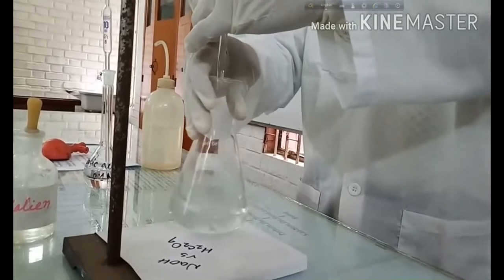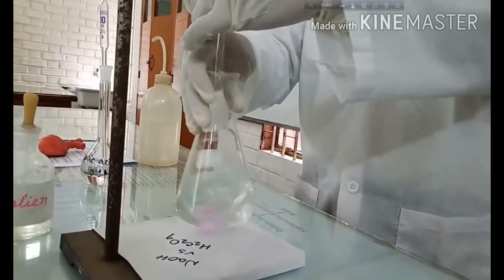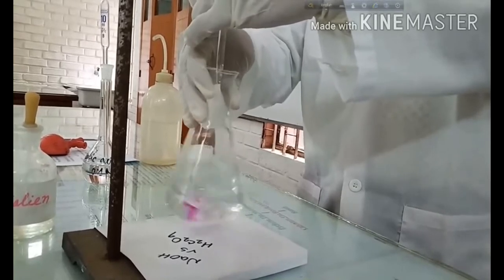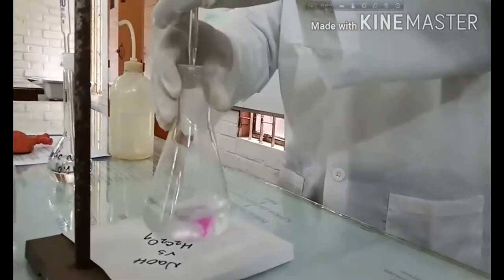The pink color is disappearing because it indicates that there is still a lot of excess H plus ion in the conical flask. When we are adding the base, that means hydroxyl ion from the burette, it gets pink color suddenly, but it disappears.